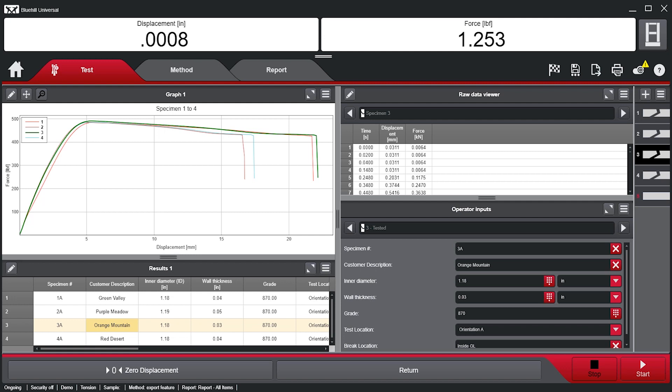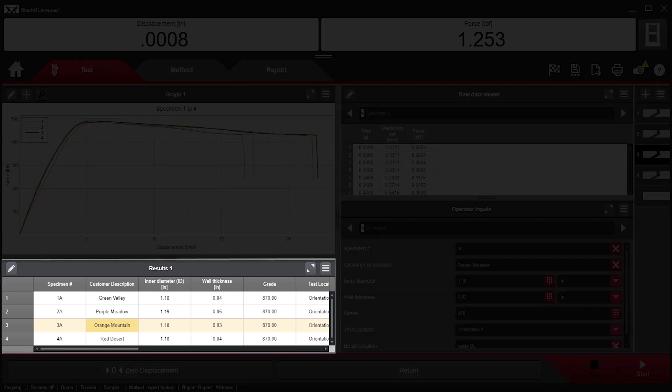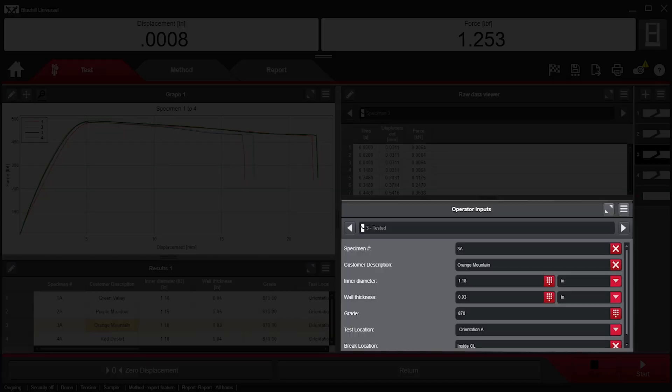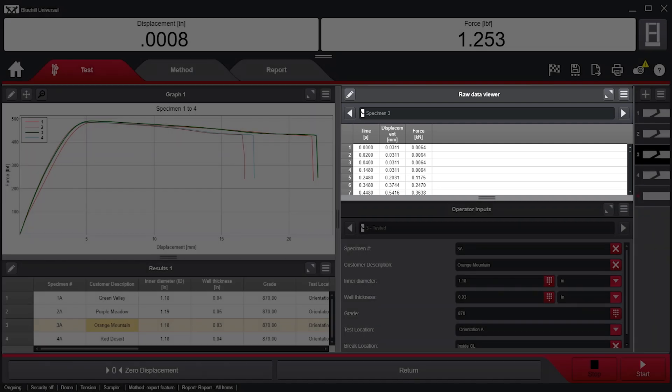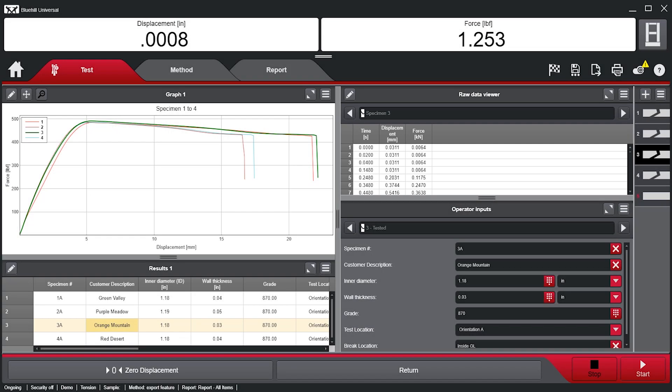Here we have a sample file open with several tested specimens. You can see I have a results table, operator inputs, and the raw data viewer configured. Users can configure Bluehill to determine what, how, and when data is exported.